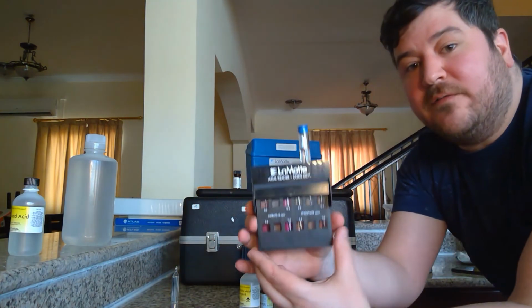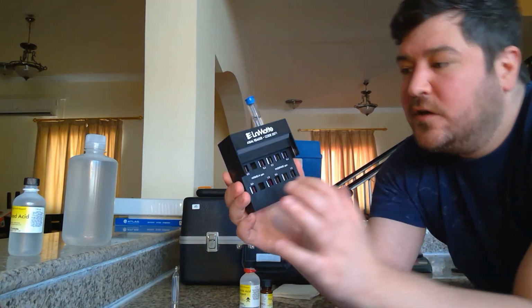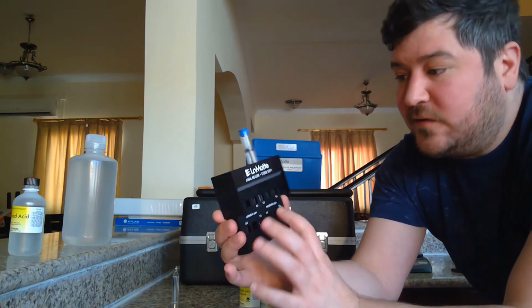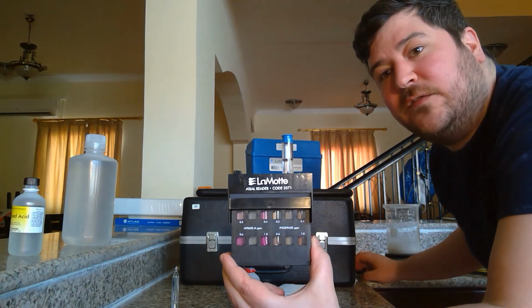So again, we do have a small amount here. I am seeing a match, but the match does match the standard. So this would be less than 0.2 ppm. Okay, it's certainly not the 0.4 or 0.6. Okay, so there's the results from the phosphate test.